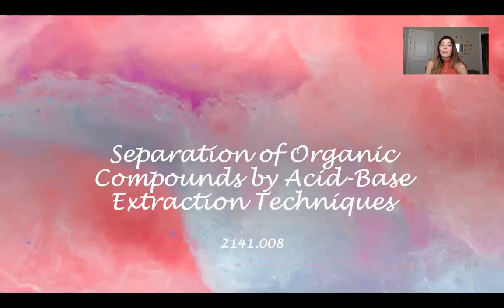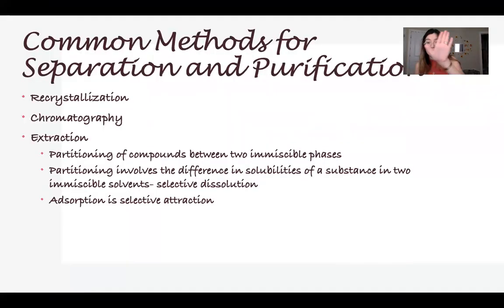Separation of organic compounds by acid-base extraction techniques, my absolute favorite lab. Common methods for separation and purification. We have already seen recrystallization and chromatography, which involve adsorption, which is selective attraction. We're going to be doing something completely different from selective attraction now. We're going to be doing extraction, which involves the partitioning of compounds between two immiscible phases.